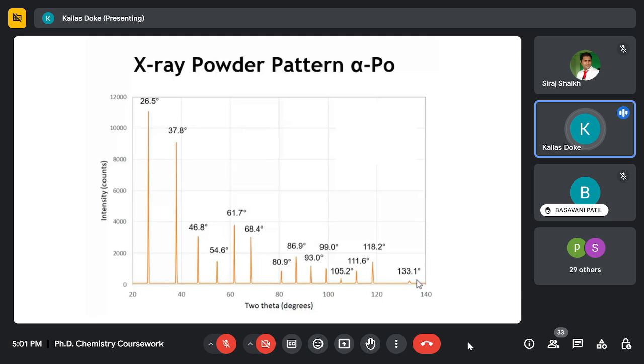The calculation which is mentioned over there, is it applicable only for the cubic crystal system? Only for the cubic crystal system. For hexagonal and tetragonal, the formulas are different. The planar formulas are different. The simple cubic, body centered, FCC and diamond types are only for the cubic crystal system, which is one of the seven crystal systems. For the rest of the crystal systems, that formula cannot be applied. There is another formula.